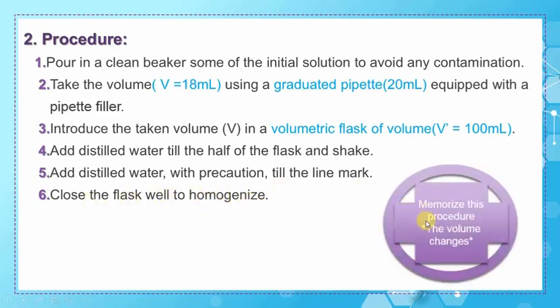Don't forget to memorize the procedure and pay attention that the volume changes with the exercises. As the calculated volume changes, so the graduated pipette changes its capacity and also the volume of the volumetric flask.